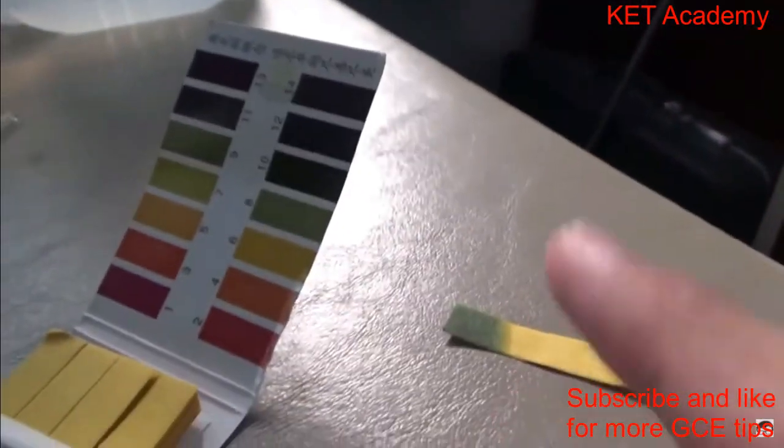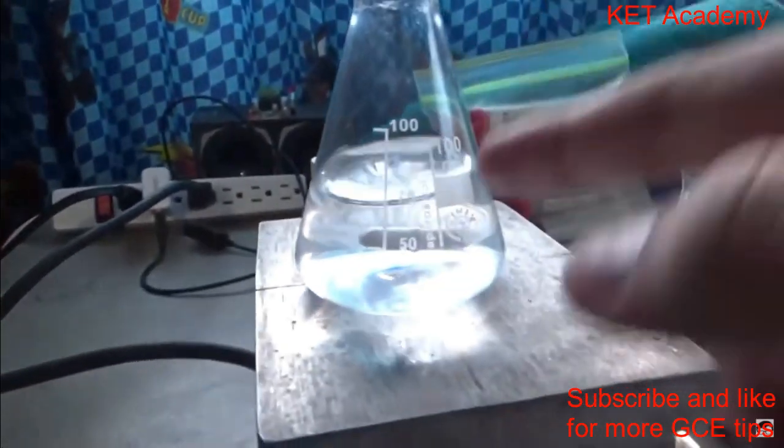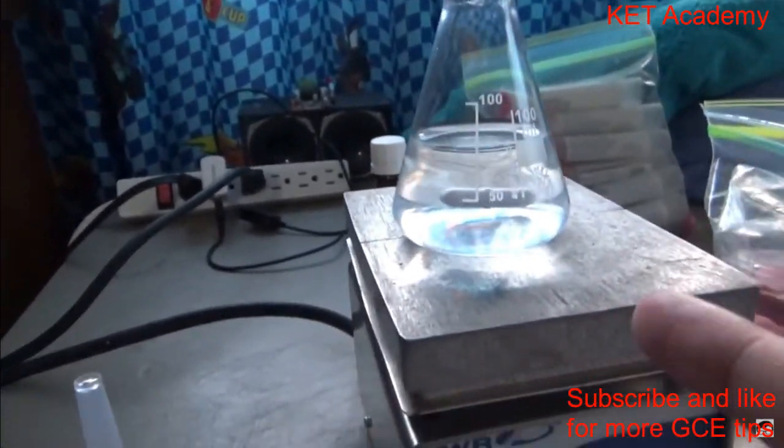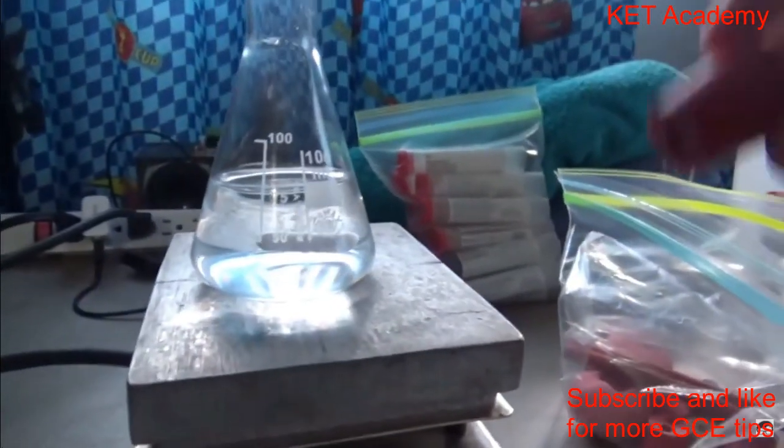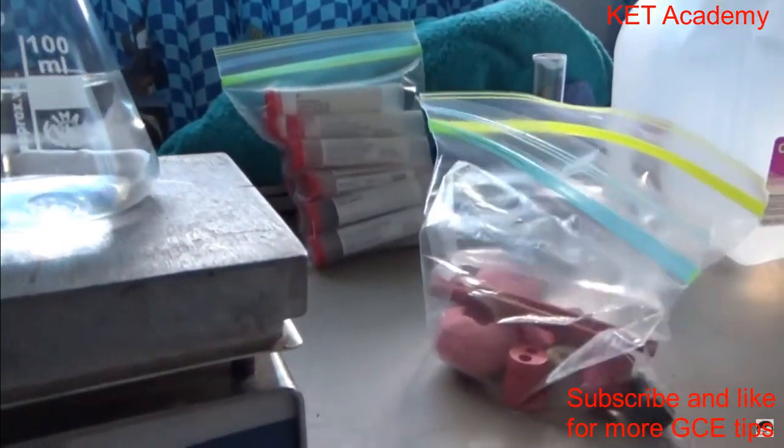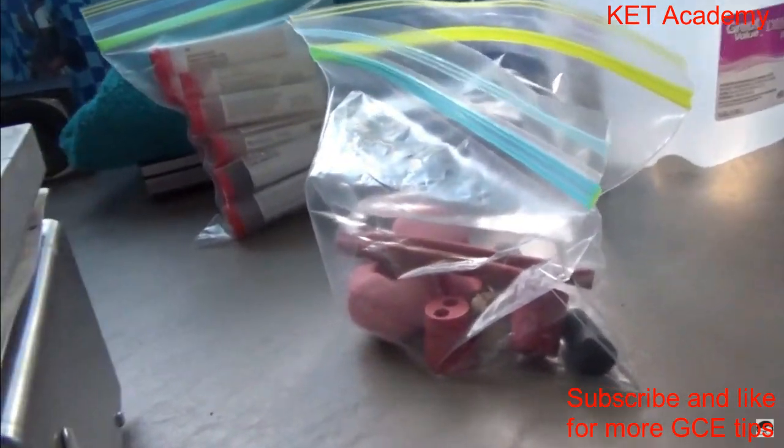So that is interesting. We'll keep that in mind, but I still want to perform a lime water test to make sure we have carbonates present. If the lime water test is positive, that means we definitely have carbonates, which I'm guessing is potassium carbonate. So far so good. Okay, so I'm going to set up the apparatus real quick, and I will let you know when I am done.